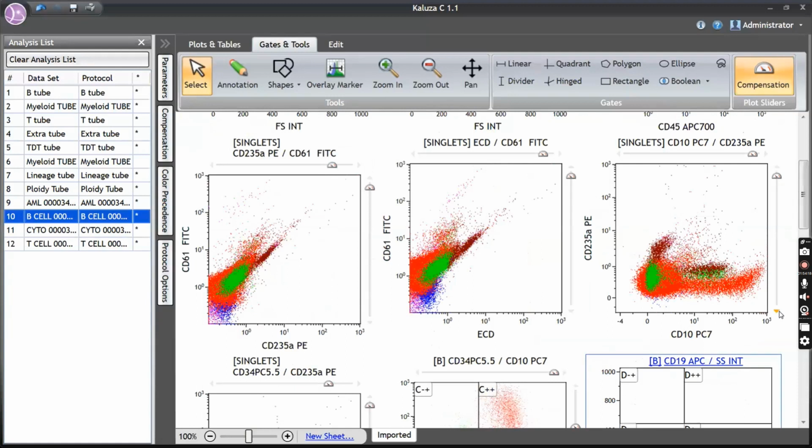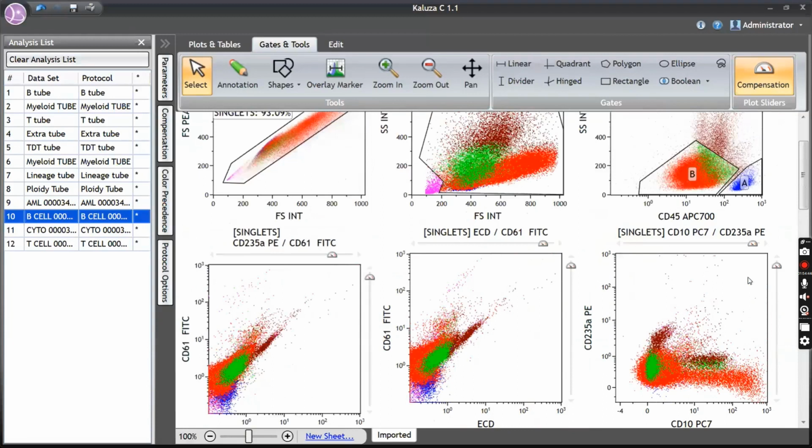Okay, and to reply to your question, your diagnosis of AML, provided MPO should be positive. If MPO is positive, then AML with aberrant 19 is a possibility. But here I find 10 is there in a subset, and it is quite bright in that population. Predominantly it's negative, but that subset is going up to the bright area. So that I need to consider.